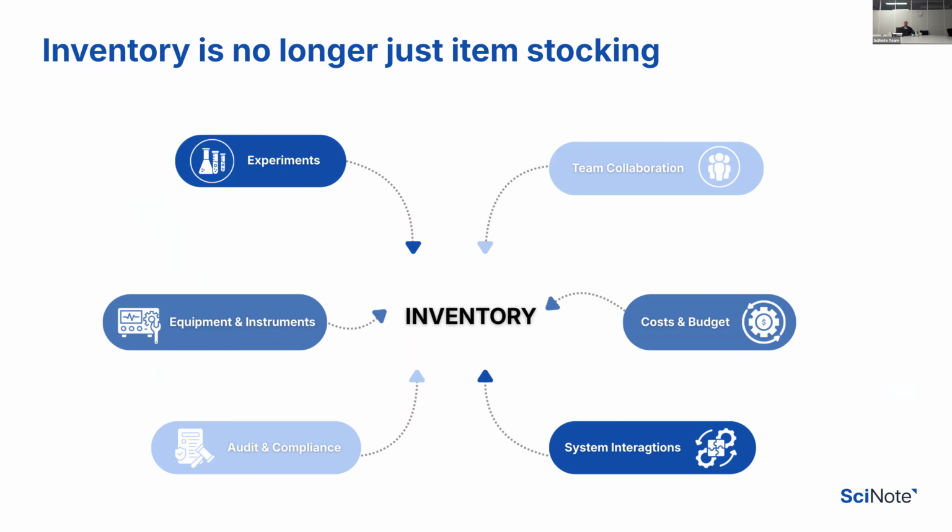Costs and budget, of course, right? So there are so many costs associated with expired reagents and chemicals. It's easier to budget if you know how much of something you have and you can plan for it.